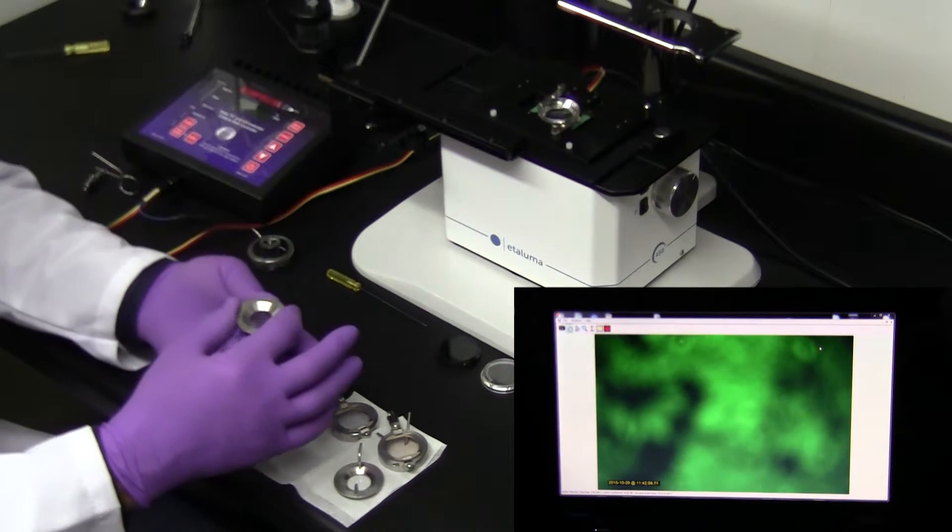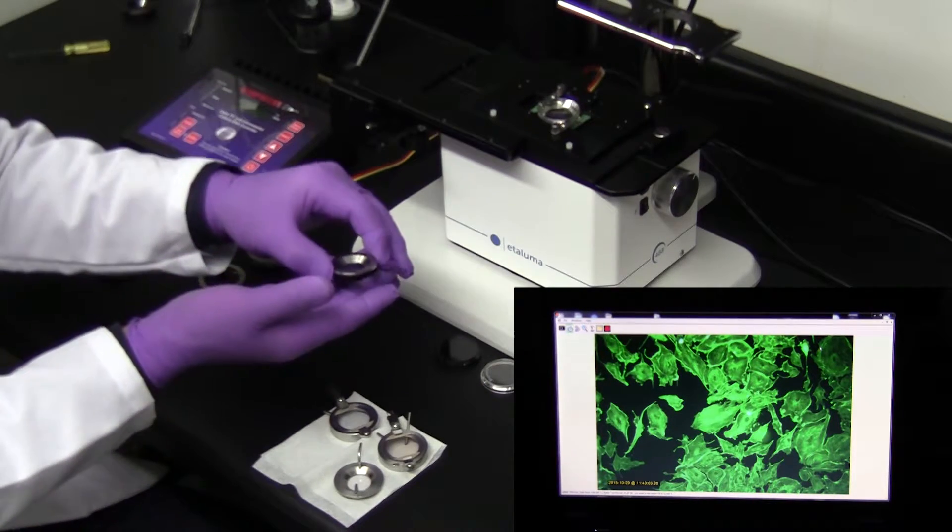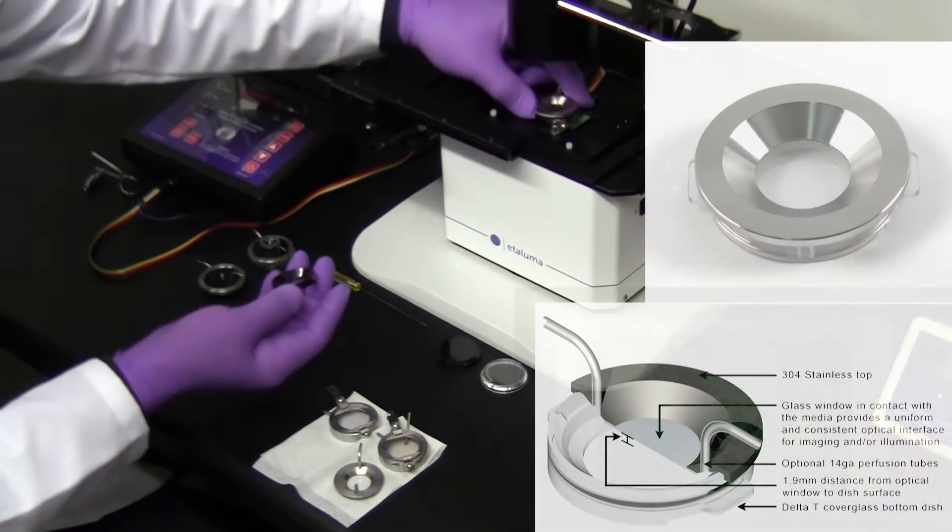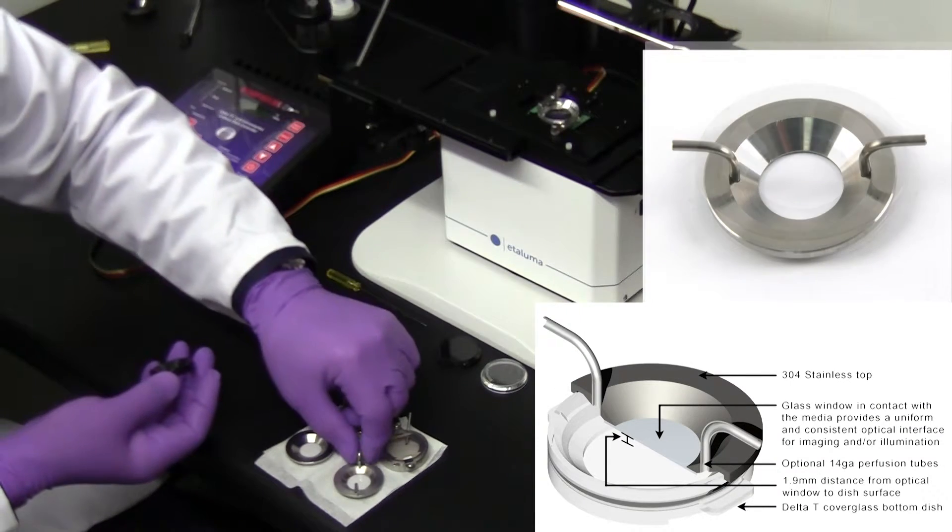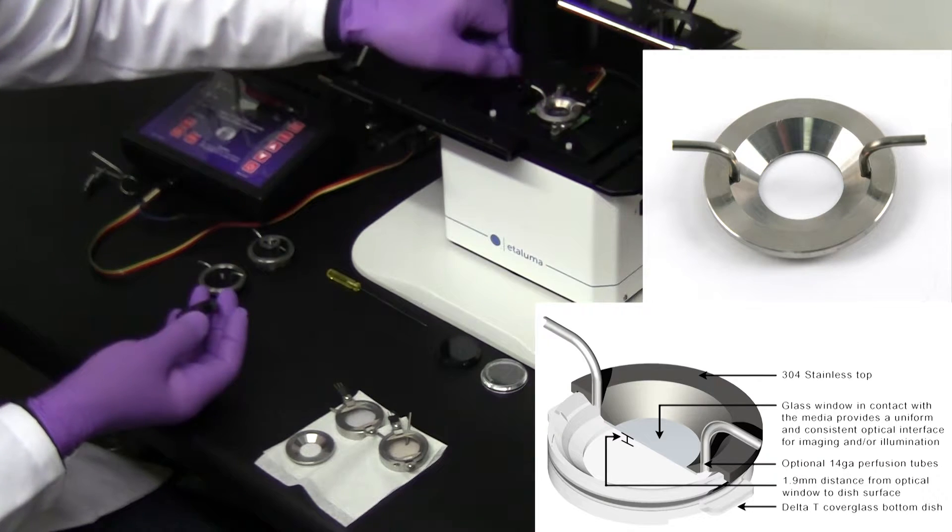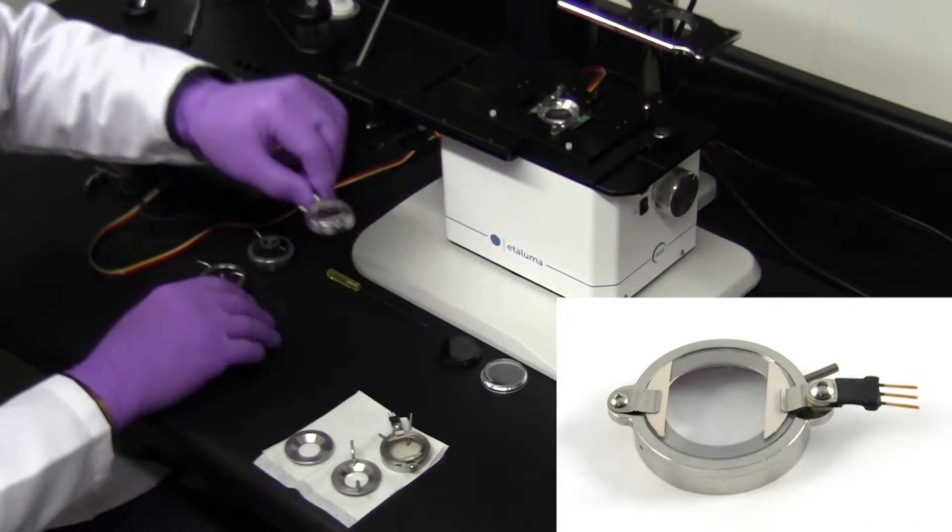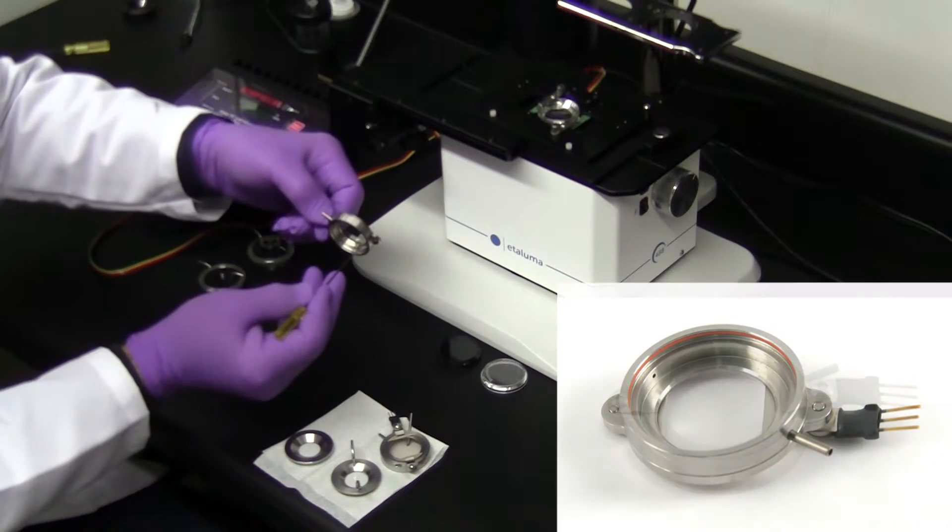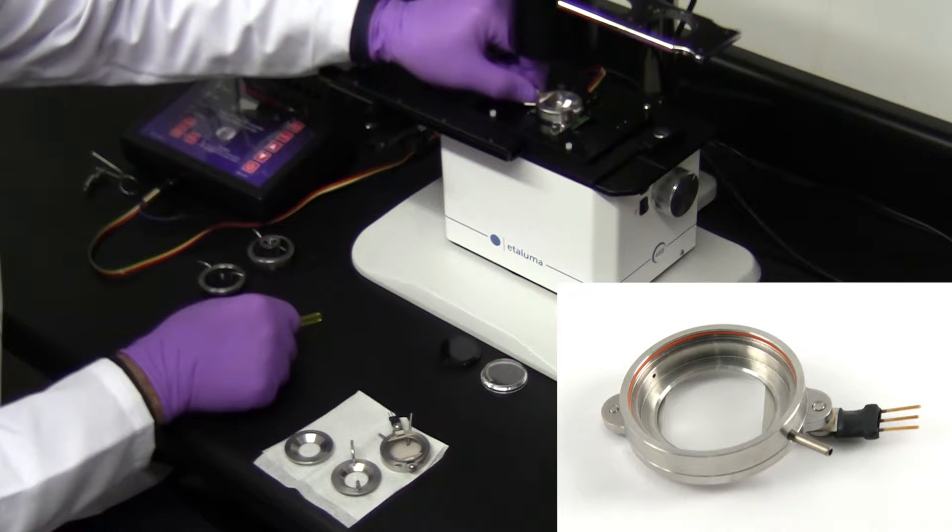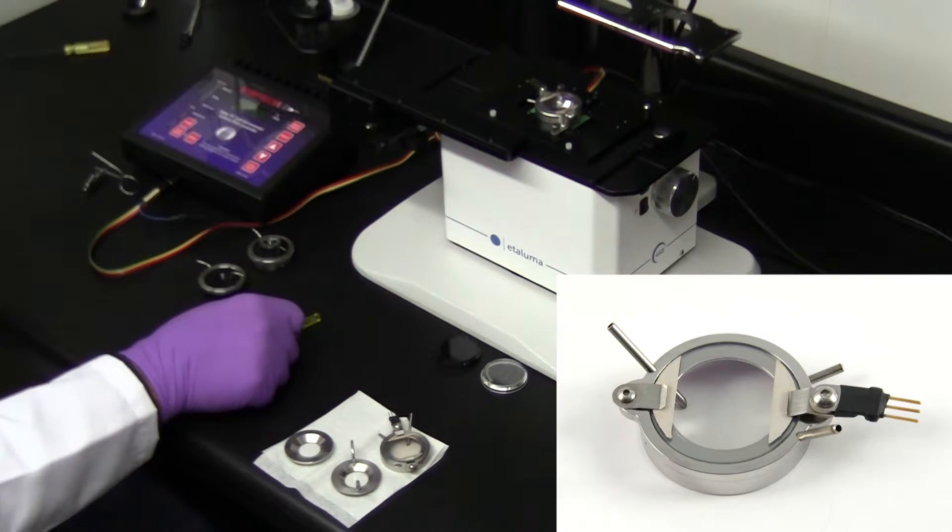Here is a cover glass lid that is used to provide an optical surface on the top of the media to ensure transmitted light images are free from contrast shifts due to fluid motion at the air-to-media interface. It is also available with perfusion ports. Next is a heated lid that encapsulates the atmosphere above the specimen, prevents condensation from occurring, and provides a port for the introduction of specialized gases. It too is available with perfusion ports.